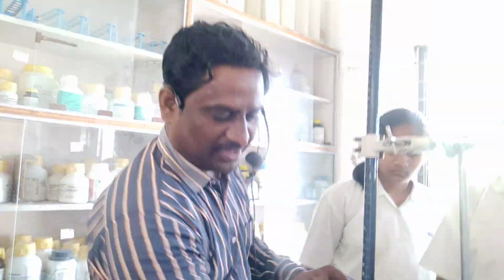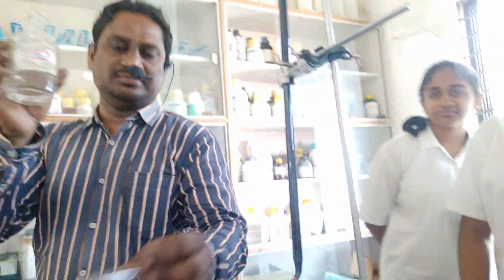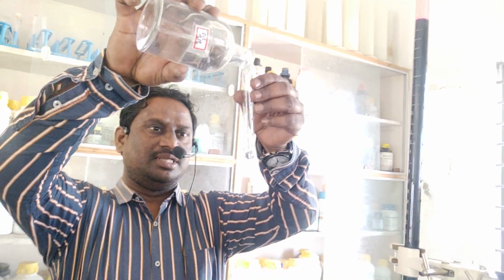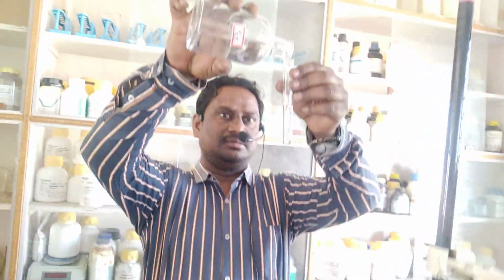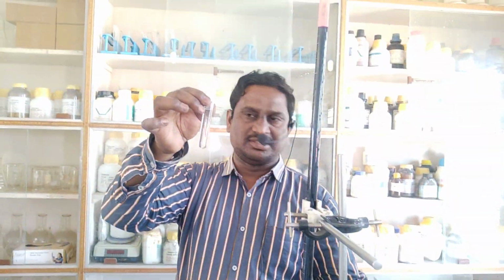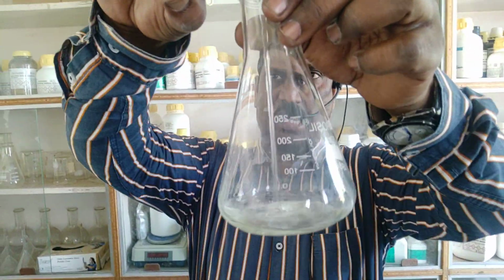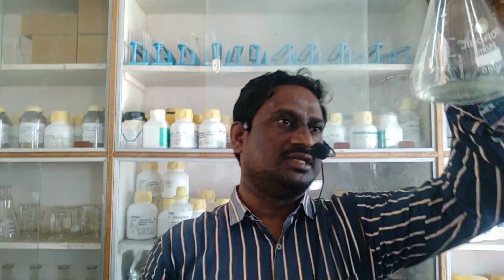Clear? See the second point. Add half test tube of dilute H2SO4. So this is dilute H2SO4. Okay, are you observing? So this is the test tube, and half test tube of dilute H2SO4 we add. Like this, half of the test tube we add. And this dilute H2SO4 we transfer to this FAS solution. Clear?